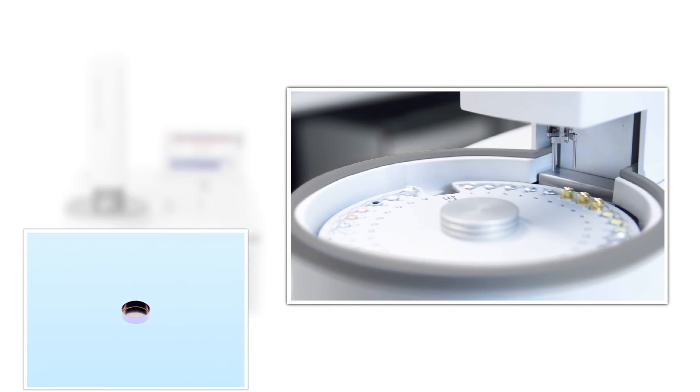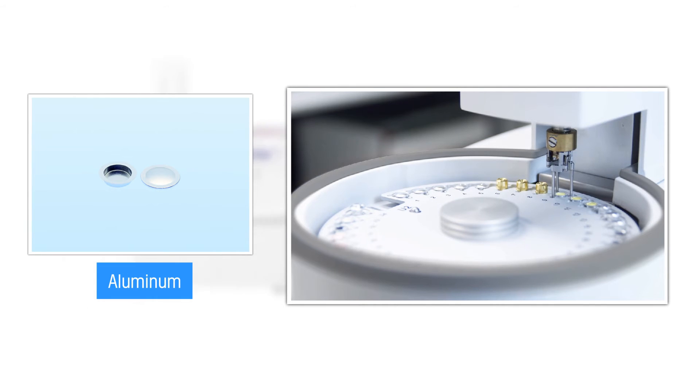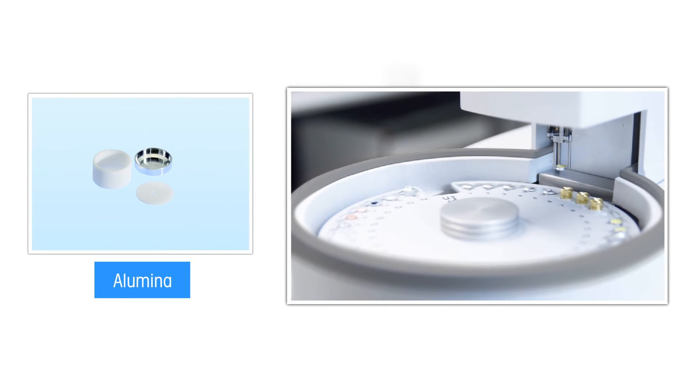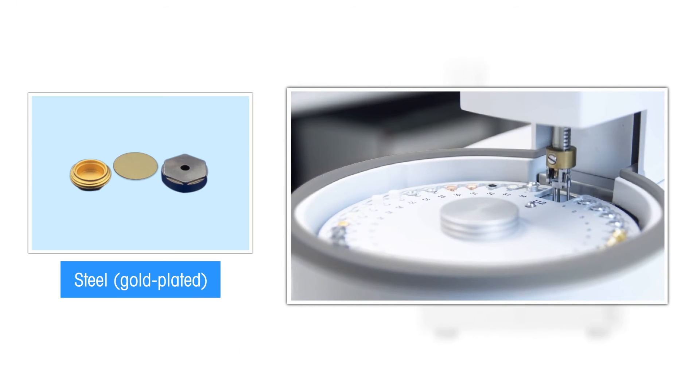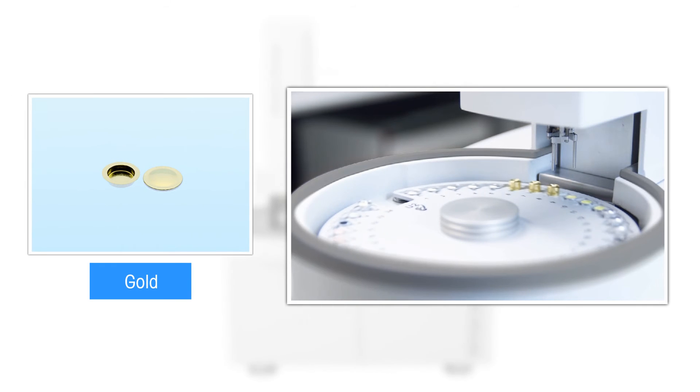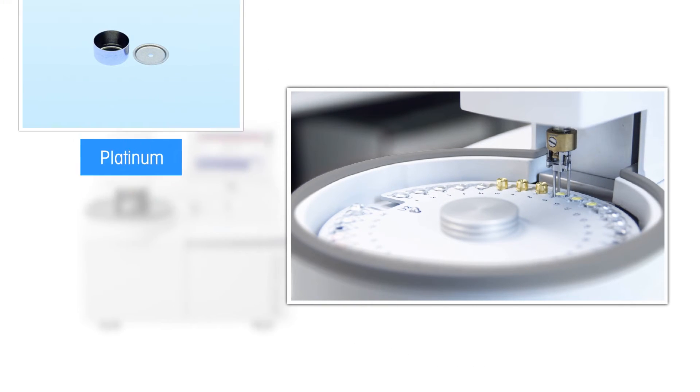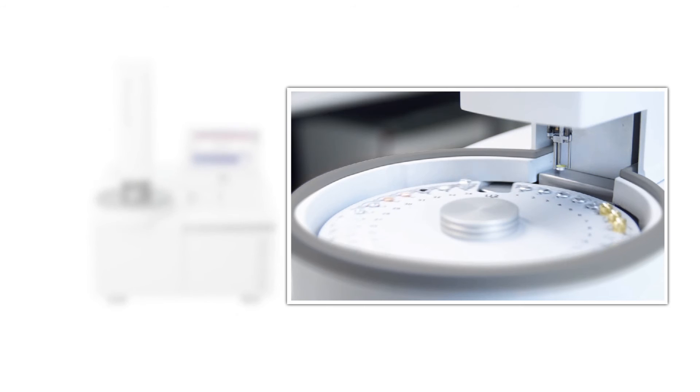As a result, running your samples using different crucibles from the wide selection offered by Mettler Toledo can be done very efficiently using the benefits of FlexCal. No extra adjustment is necessary, thereby saving you valuable measurement time for other analyses.